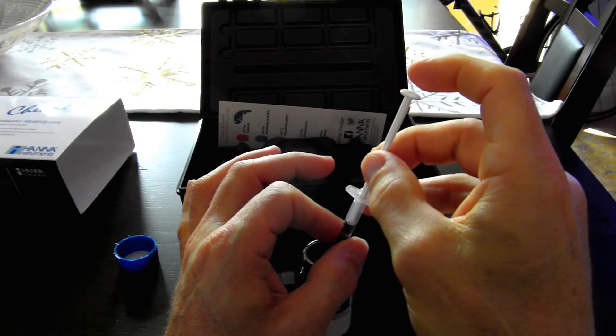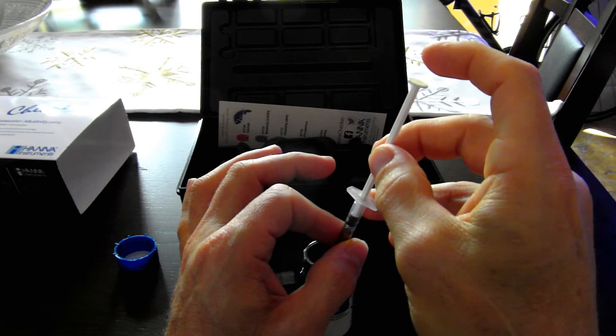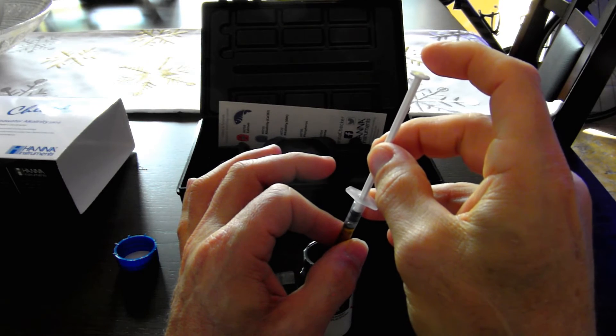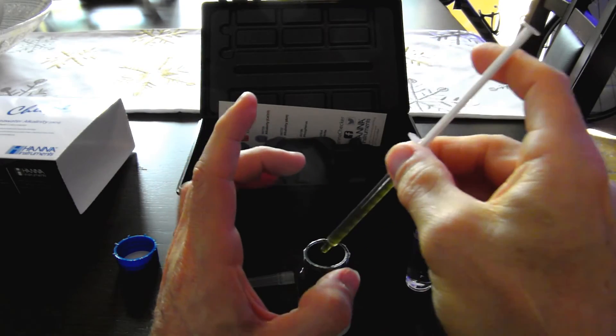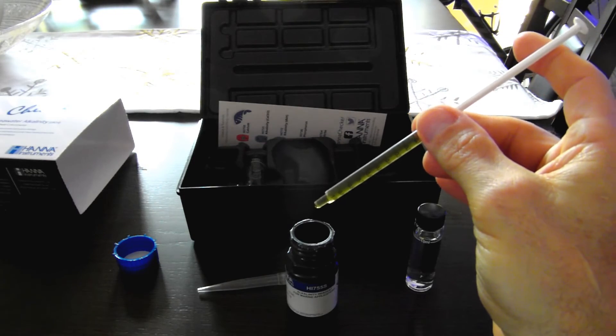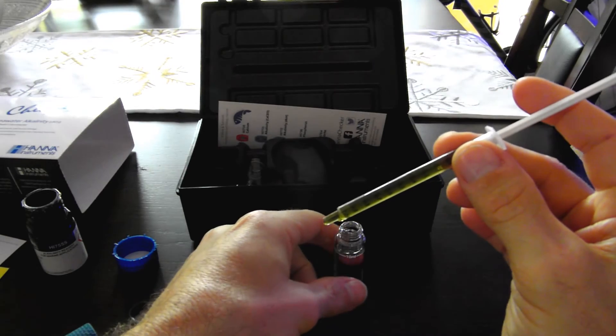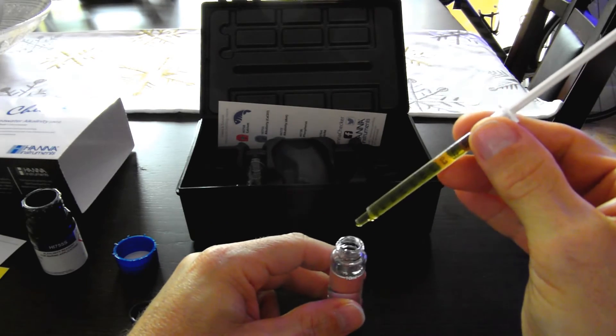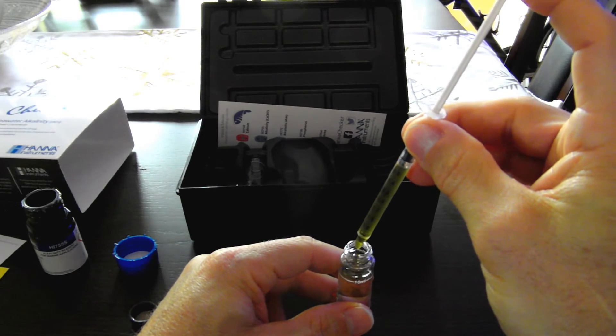I've got a little bit of air in here, so I'm going to make sure that the level of the reagent is at the 1 milliliter line. Here's the reagent, and here's the 10 milliliter sample of aquarium water. I'm going to drip in the full 1 milliliter.